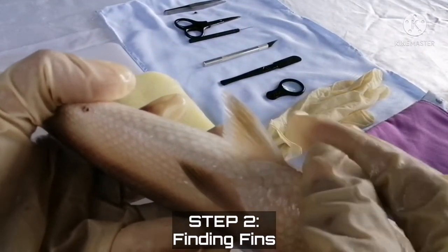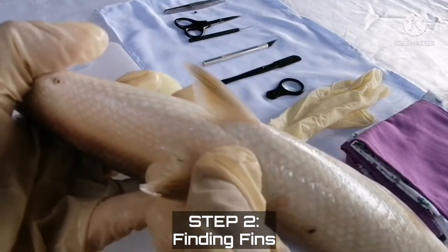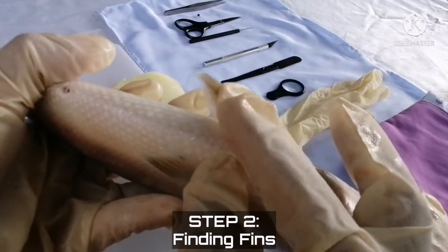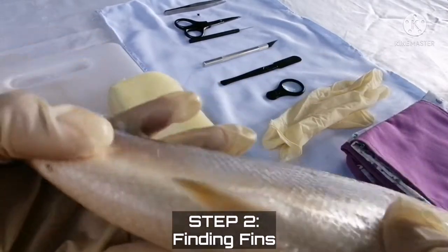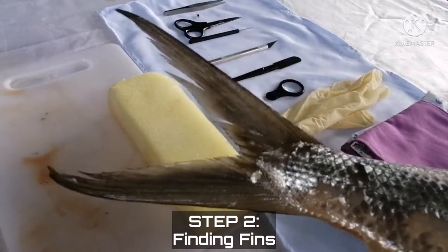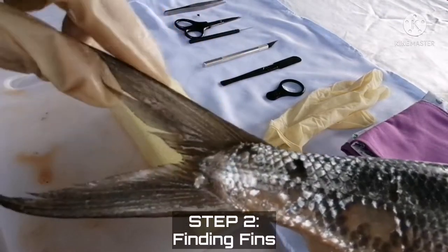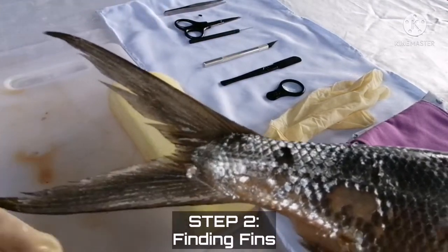Next is the anal fin that is located on the ventral surface behind the anus. It provides stability and functioning of the fish while swimming. Last is the caudal fin, which is also known as the tail of the fish. It acts like a propeller of the fish, and it is also the largest fin of the milkfish.